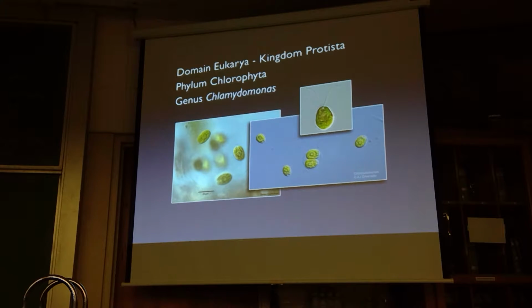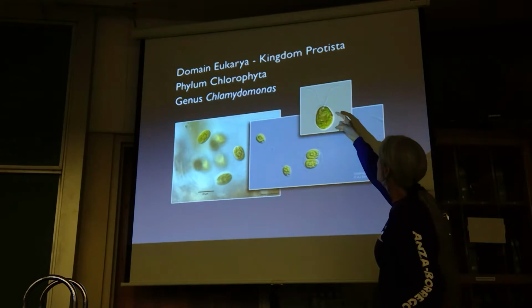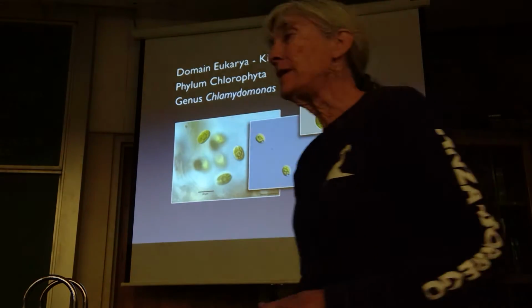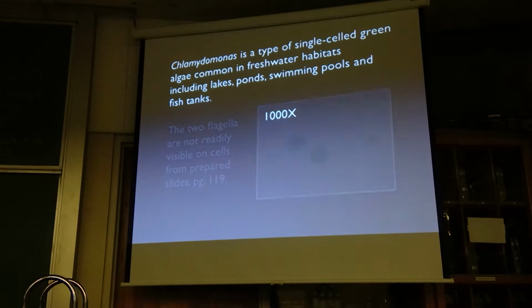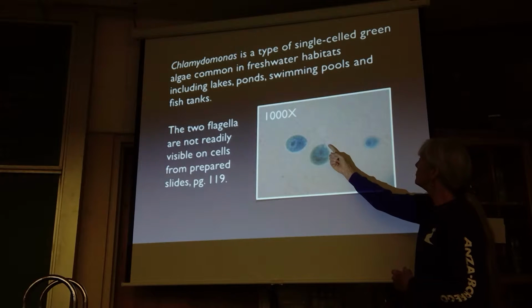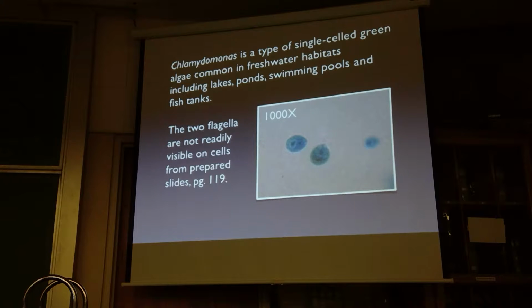They are little single-celled organisms with two flagella. So here you can see the flagella coming up at one end. They're roughly oval-shaped, maybe a little bit more pear-shaped. The flagella come off their narrow end. On our prepared slides, they're not nearly that nice looking, because on the prepared slides, you can't see their flagella. Well, maybe you can if you have a really good imagination. If you look at the front row, can you see one flagellum here and one flagellum there? No. Cool. Well, they're there.